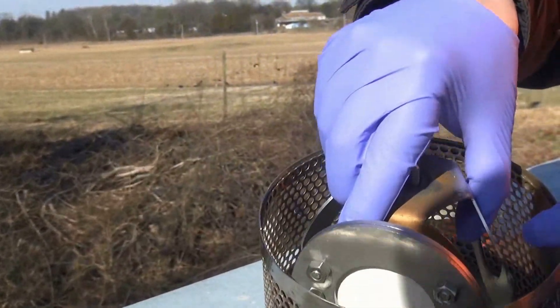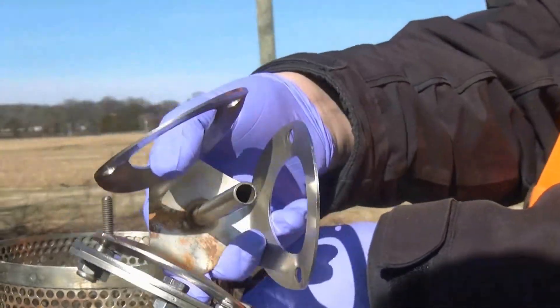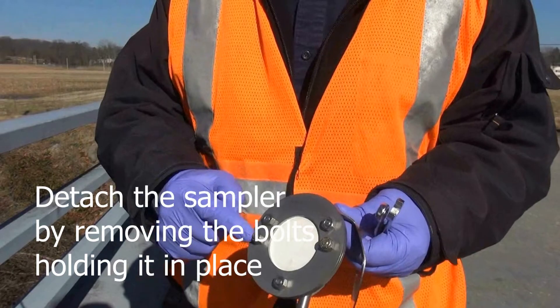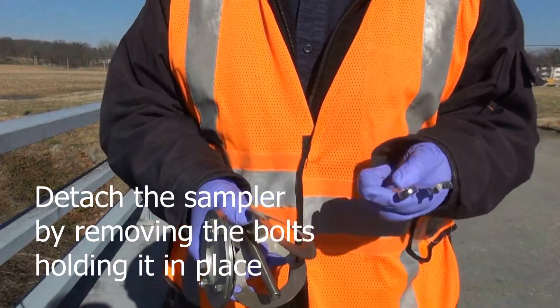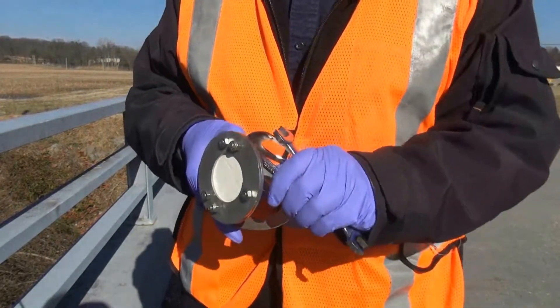Remove the sample holder. Detach the sampler by removing the hex nuts and bolts that secure the disc to the holder. Be careful not to loosen the bolts that hold the metal rings of the sampler together.